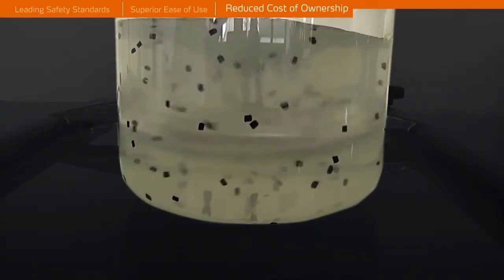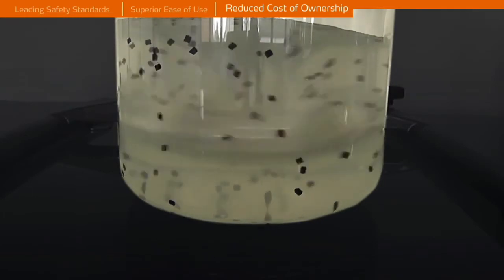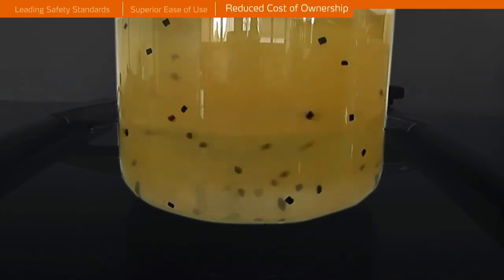The patented cone principle creates, even at low speeds, a turbulent flow which is unique, and mixes gels and other challenging media with ease.